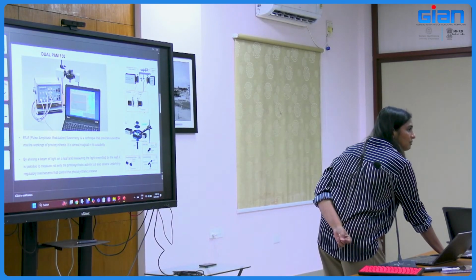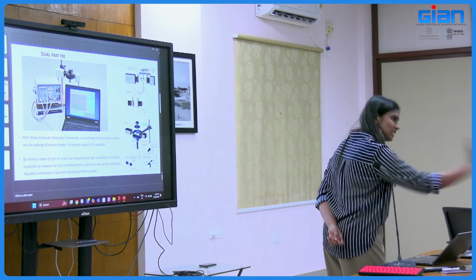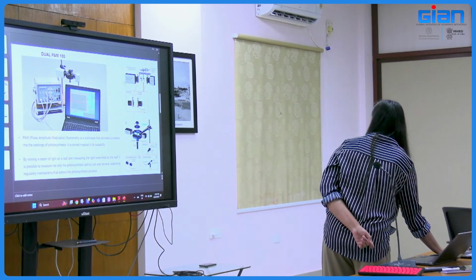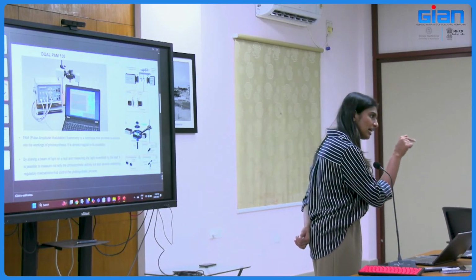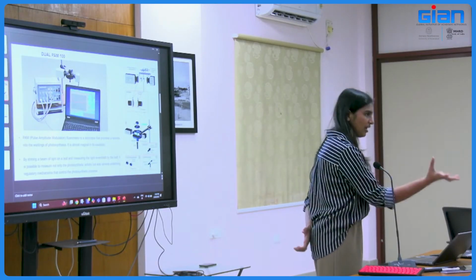When you want to study PS1, you keep this probe for emitting the light, and you keep the sample here in between. So the light passes and gets detected here. This detector listens to whatever signal comes, whether it is the measuring light frequency or the actinic light, which is very high.